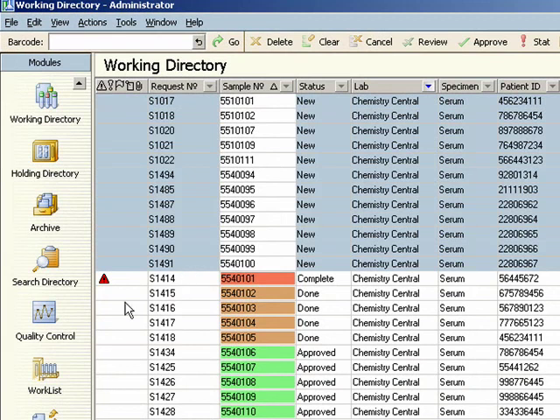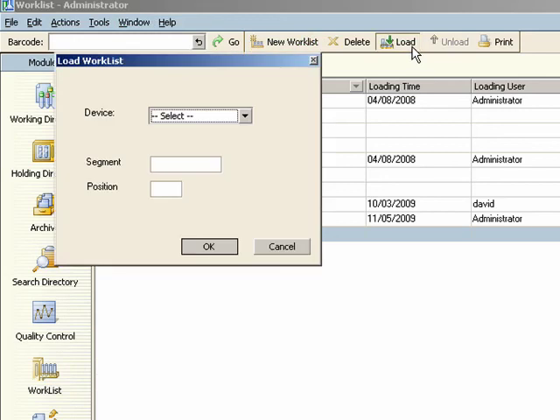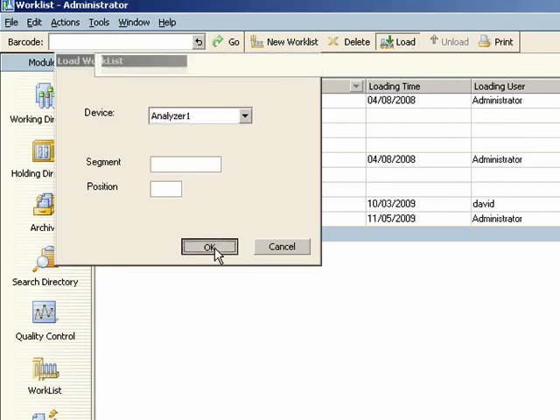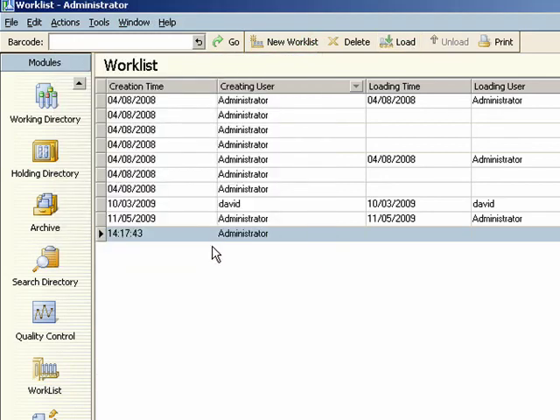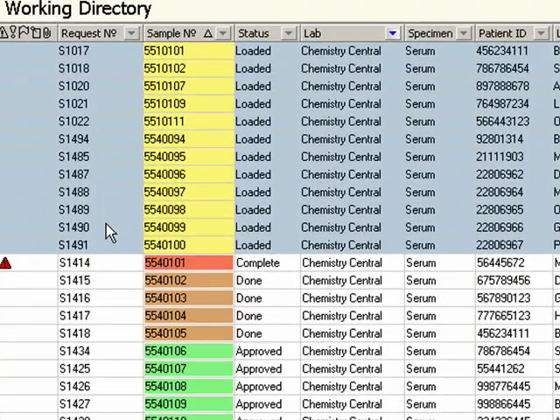After sorting, aliquots are prepared and delivered to the analytical stations or automation lines. eLab supports uploading requests to analyzers by dedicated worklist and a variety of query modes.